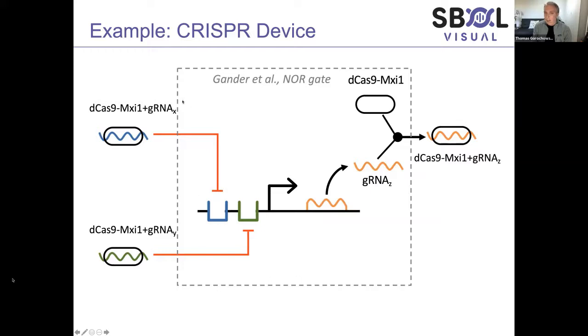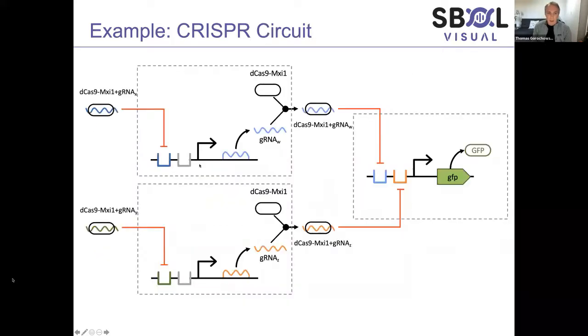So you can think of this as a module that you might use in multiple cases elsewhere in other designs. And that's precisely what this is representing: you take this module and you can then put many of them together to create a more complex circuit and show how that works. And that's really good when you have very complicated designs with lots and lots of parts, because being able to show which bits are doing what functionally helps a lot with understanding.